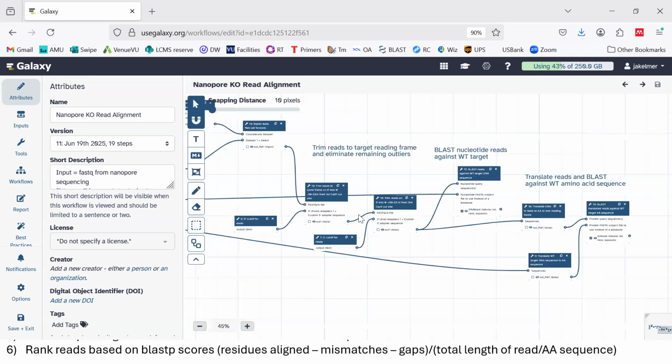This should be a very small fraction of your total sequences, but it will simplify the analysis later on. We might be cutting out some valid sequences here, but the assumption is that that number will be so low, it's negligible, okay? So we take all of our reads, make sure they start at the same base on the 5' end. And by the way, here's an input there. That's for that red text on the 5' end. And then we take those modified sequences, do the same thing on the 3' end, and cut them off there.